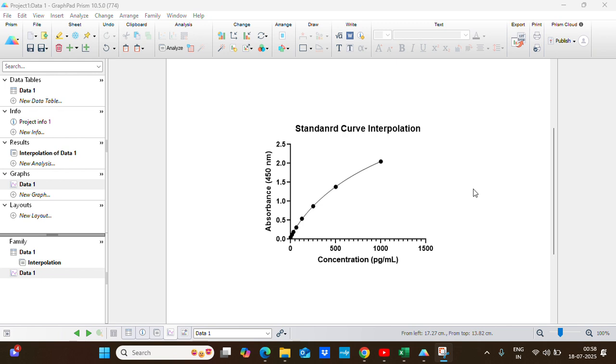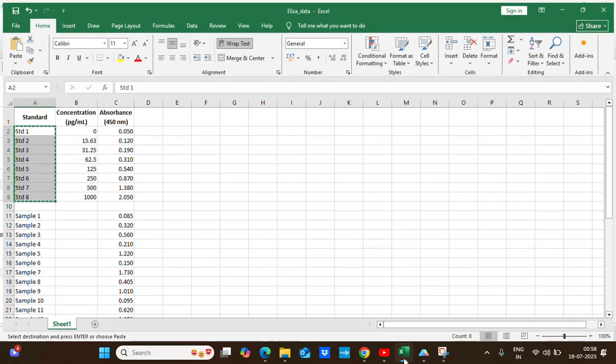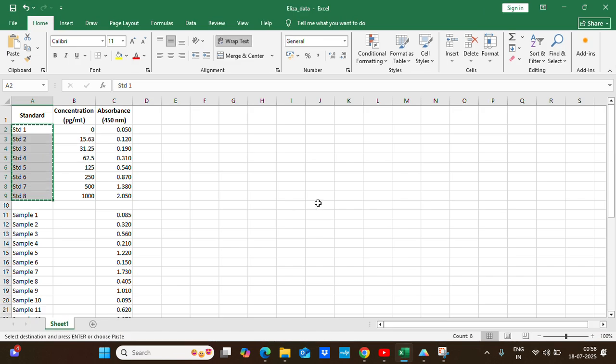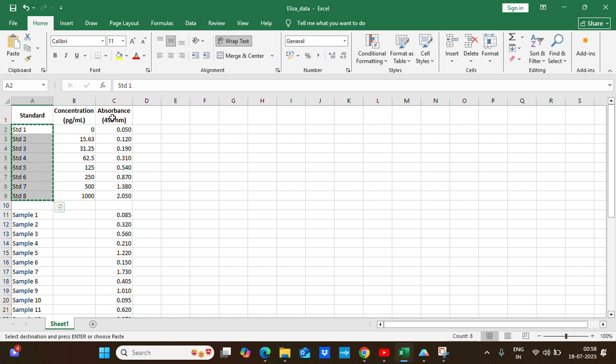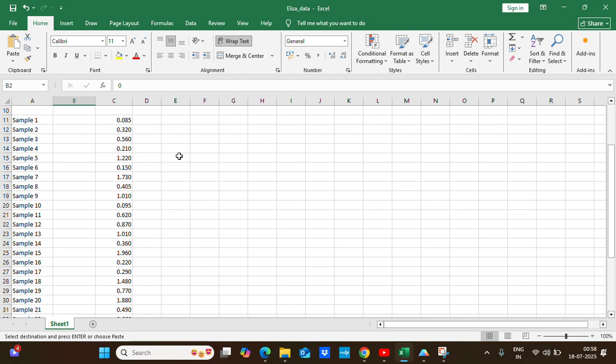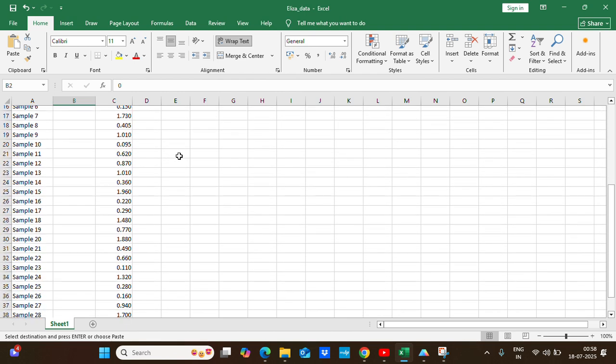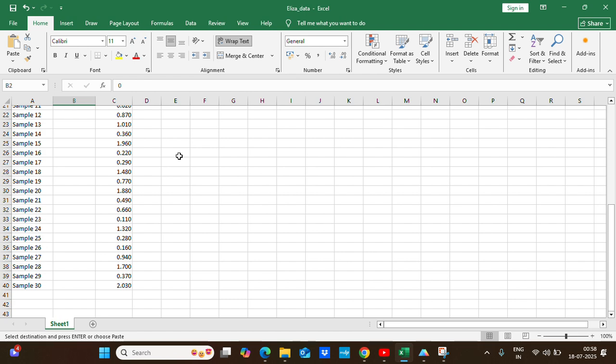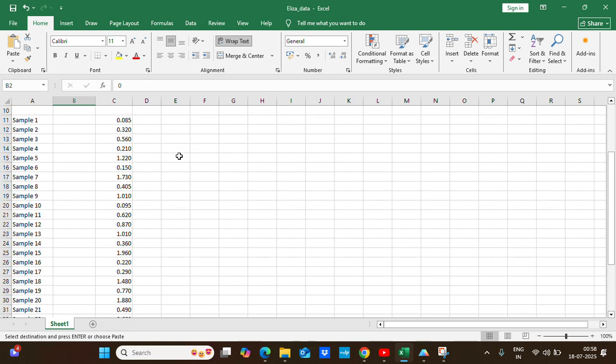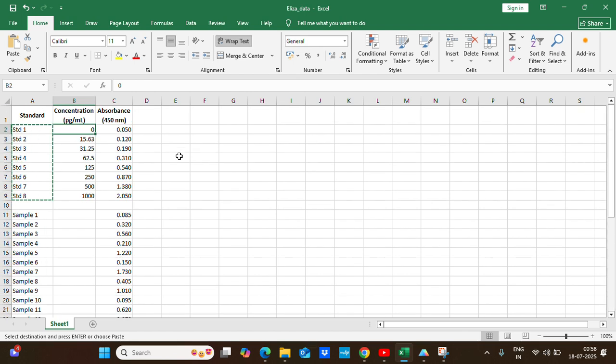Here I'm going to take an example of ELISA data which I have in my Excel sheet. In brief, I have eight standard concentrations and their corresponding absorbance values at 450 nanometers. And I have 30 unknown sample concentrations with the absorbance values, and we have to find their corresponding concentration.